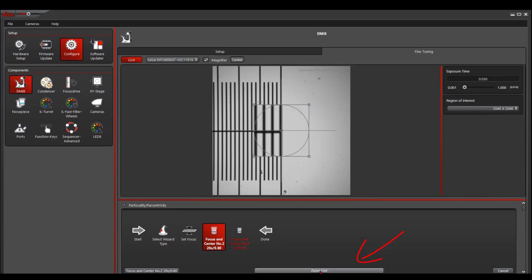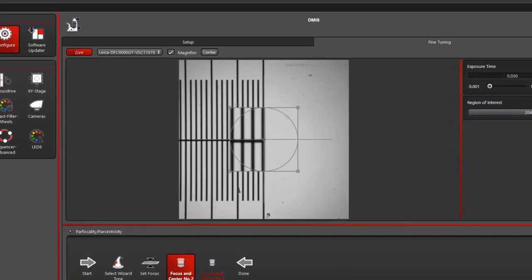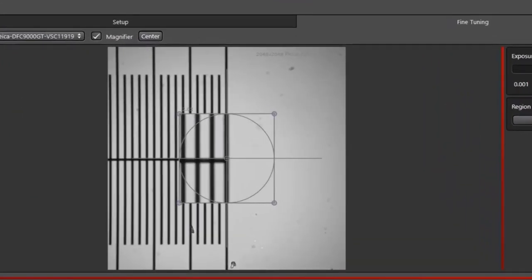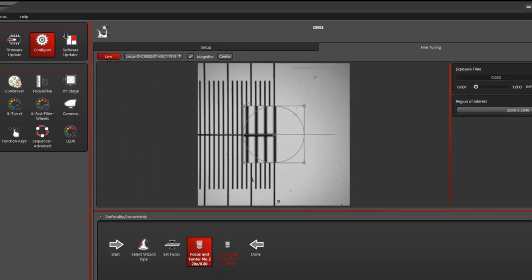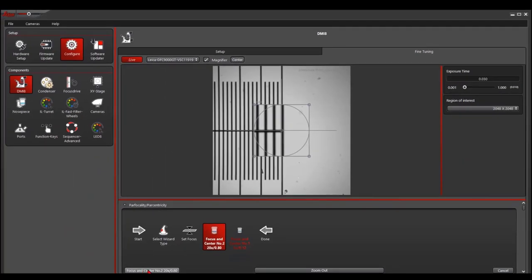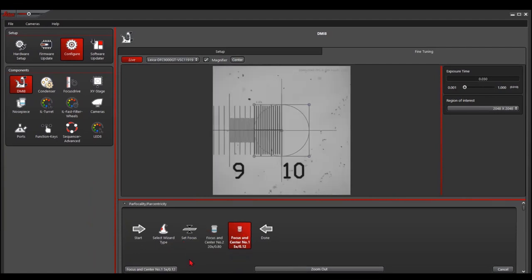You can click zoom in to get a better feel. I usually go to the top left corner of the cross. Then click focus and center. It will move to the next lens. Then we do the same thing.